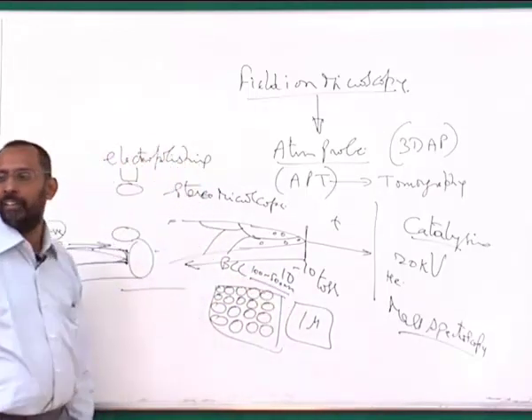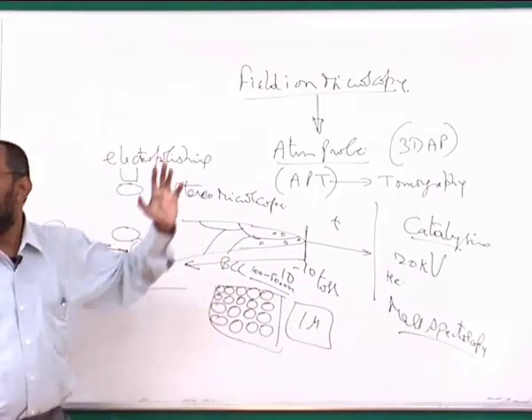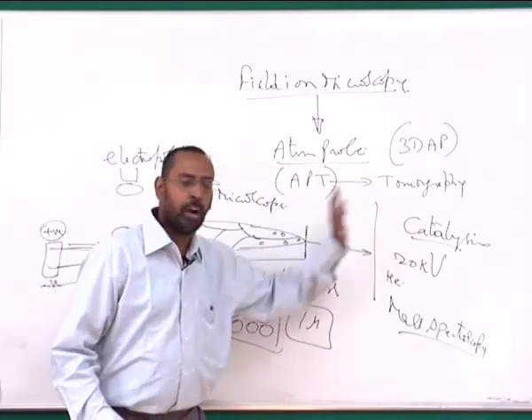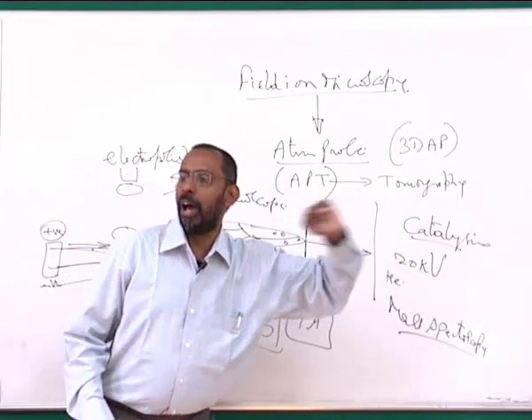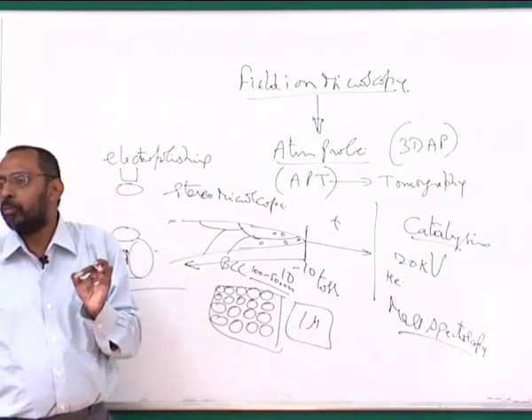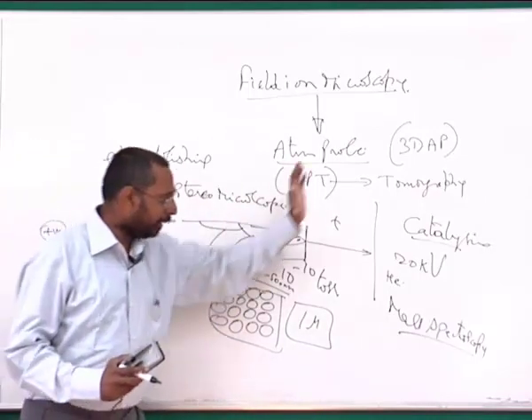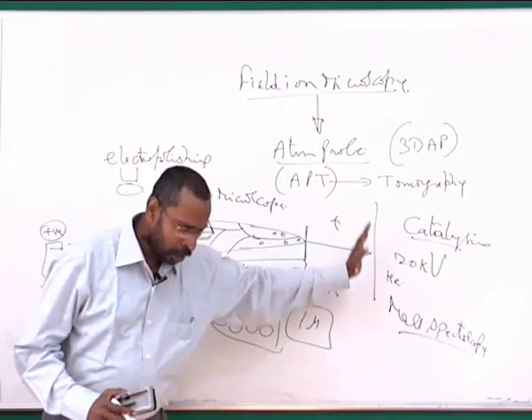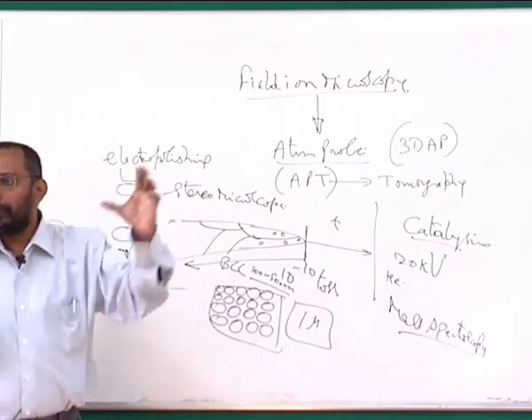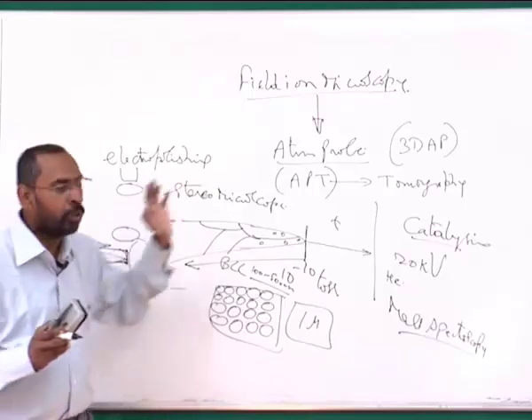This is the kind of range that we see, because as you want to collect more and more atoms, each layer has to be evaporated, and each layer you have to wait until all the atoms are collected, because you do not know whether that particular layer has a small atomic number atom or a big atomic number atom at the moment. So the detector waits until all the atoms come, and until no atom is being added within a certain period, then it says, okay, fine, now let's go to the next.